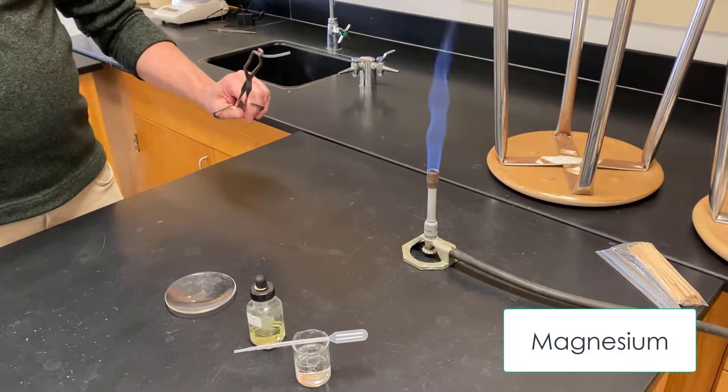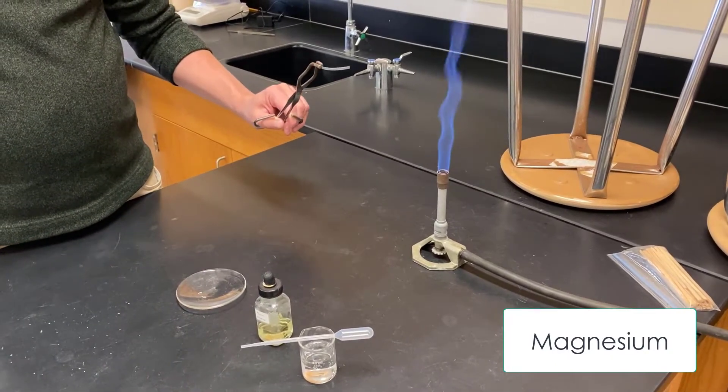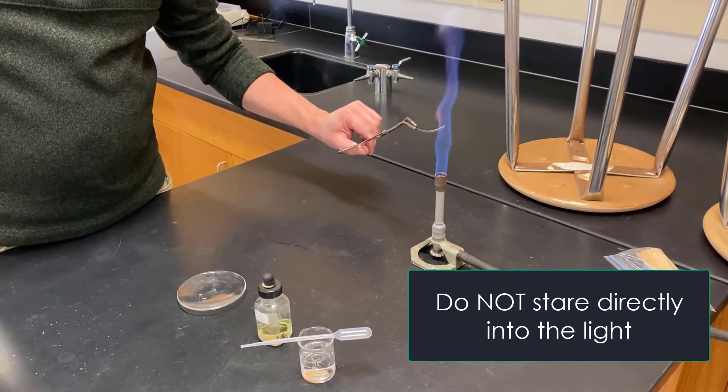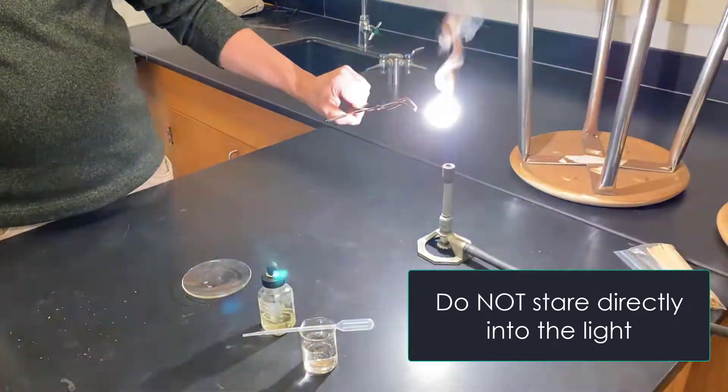For station 2, we're going to burn the magnesium. When we burn it, we're adding oxygen to it. We want to be careful not to stare too much into it, because it'll create a very, very bright light energy, as you can see there.